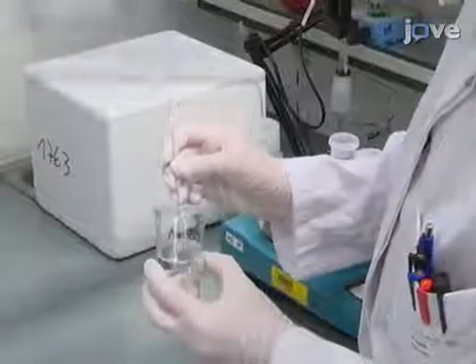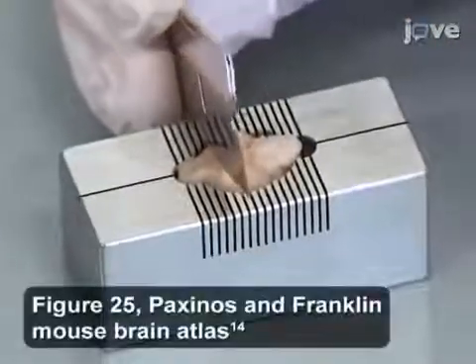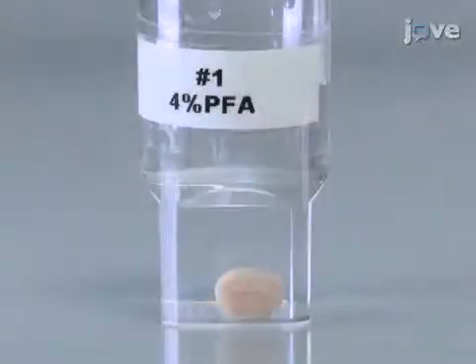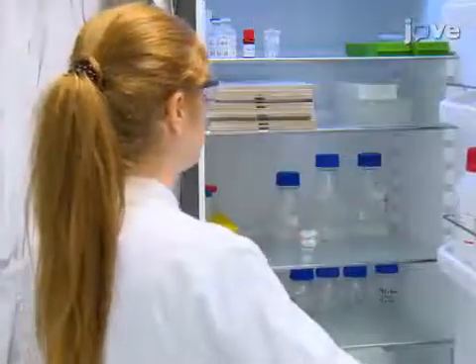Begin by placing a paraformaldehyde-fixed mouse brain into a brain matrix and making a cut plus 0.74 mm from bregma. Transfer the caudal part of the brain, including the SN, into 4% PFA in 0.1 molar and fix overnight at 4 degrees Celsius.